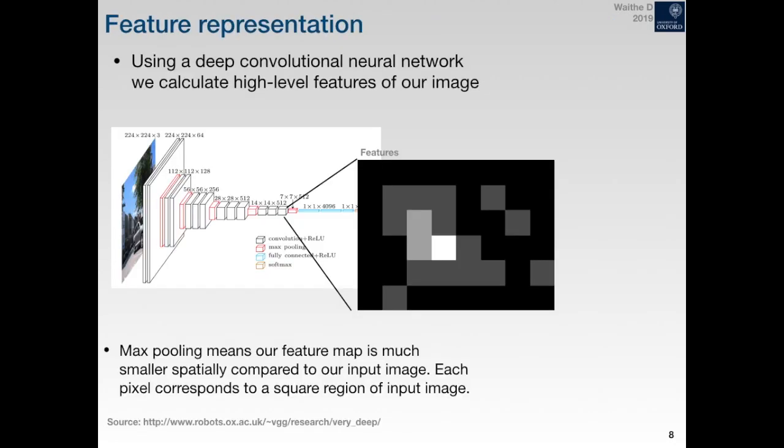What they all do on some level, and you'll hear more about this today, is use convolutional neural networks as their main building block, where we learn features which will recognize and classify objects. Rather than classifying objects specifically, we hijack the rich feature description that these networks generate, and we use it for predicting bounding boxes and classes.